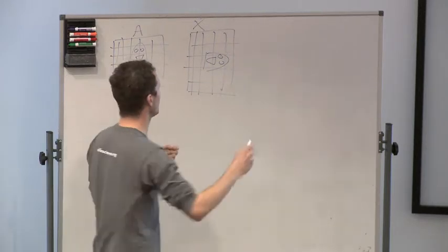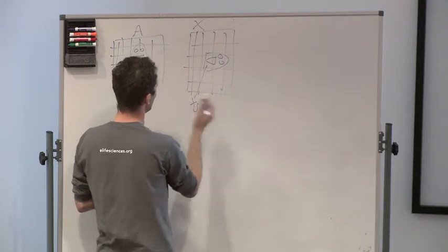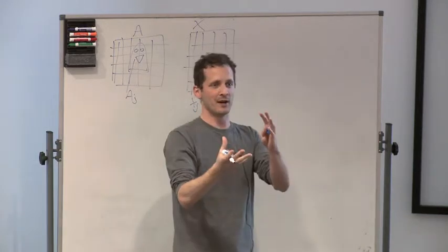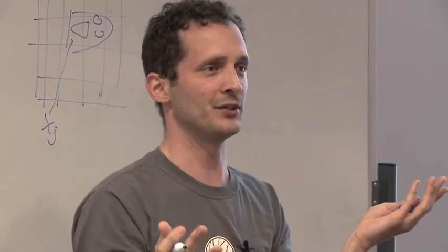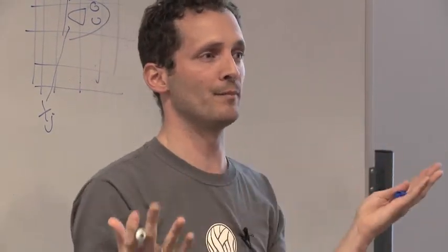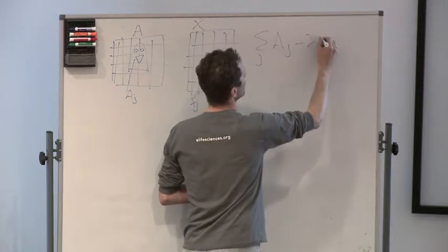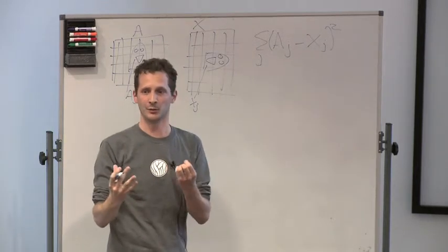And already in lecture 2, I think we saw that perhaps it would be a good idea if every pixel here has a subscript j, okay? And then a_j will be the value of pixel a_j. Then it could be good to minimize the square difference between the two images. If two images are the same and they're aligned, then their square difference will be 0. If one image is noisy and one image isn't, and they are aligned, their square difference will be some minimum, lower than the square differences when the images are not aligned, okay? So this could be a good description of how well my two images are aligned, okay?